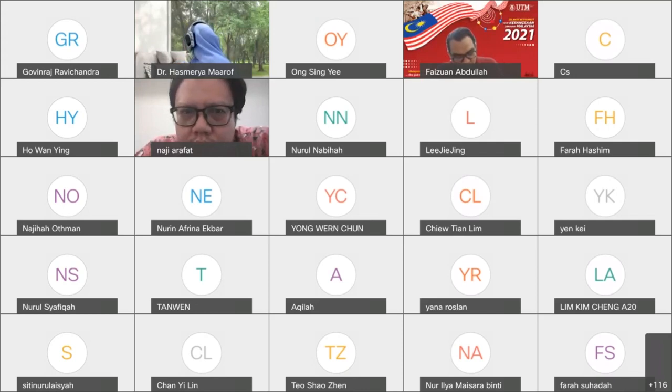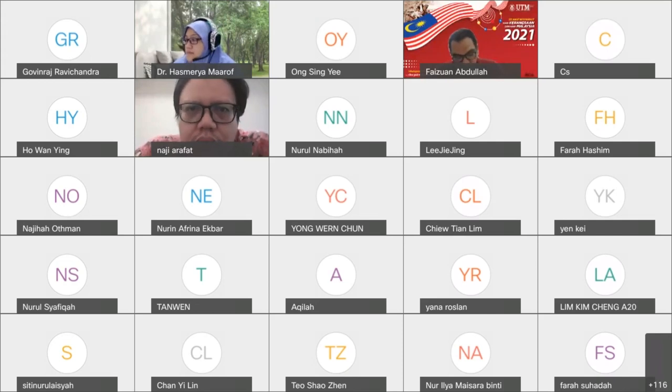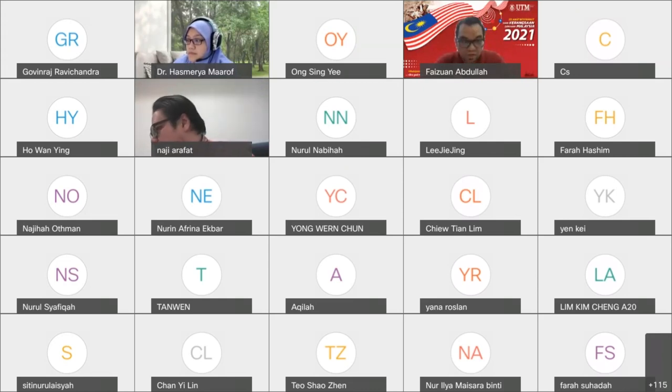The apparatus used are sintered glass crucibles, suction filtration unit, desiccators, volumetric flask, pipettes, beakers, hot plate, and litmus paper. For the chemicals, we have DMGH itself, the organic precipitant we use to precipitate the nickel, and then diluted ammonium hydroxide, concentrated nitric acid, and urea. We also have an unknown stock solution, the sample in which we need to determine how much nickel there is. And we have oxalic acid to clean the crucible.